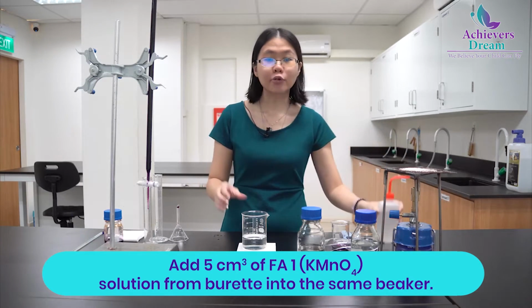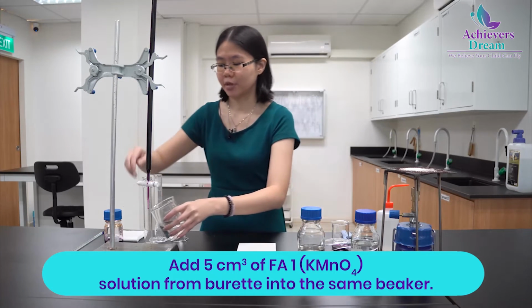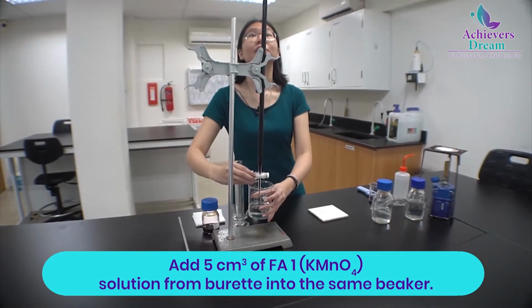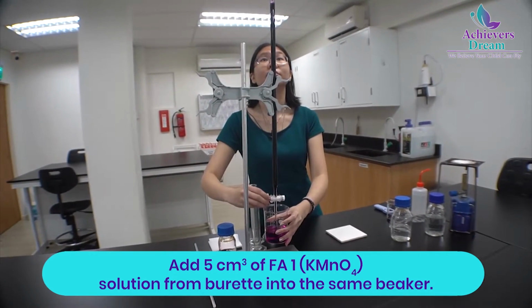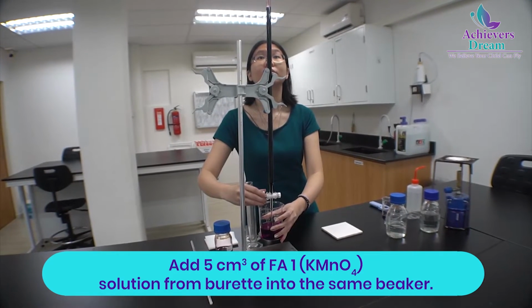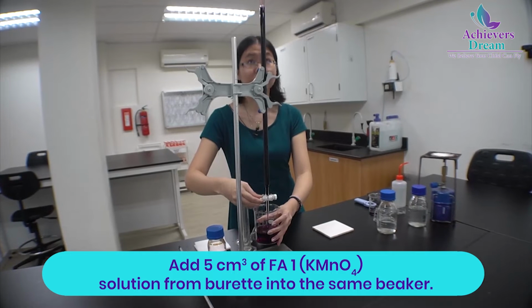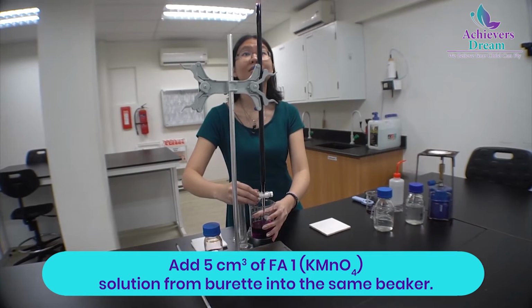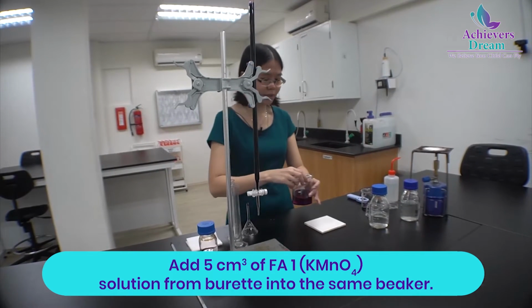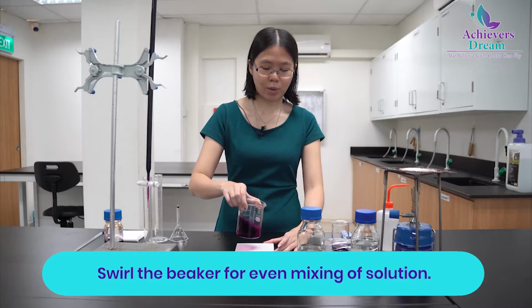Then add around 5 cm3 of your Fa1 into the same beaker. So give it a gentle swirl so that it mixes well.